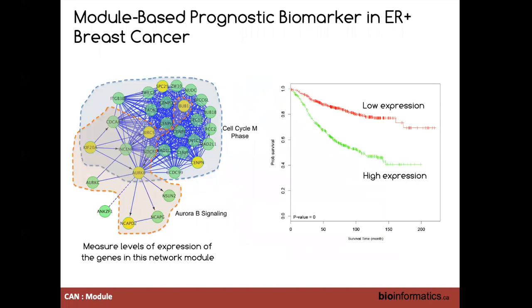Now, by combining the Reactome FI network with gene expression data, it's possible to search for network modules that are related to patient overall survival. The first step is to calculate gene expression correlations for the genes involved in the functional interactions, and then assign the correlations to the functional interactions to convert an unweighted network into a weighted one. And then you use the MCL network clustering algorithm to identify the modules. Once those modules have been identified and potentially annotated, the next step is to perform some form of survival analysis using Cox proportional hazards or a Kaplan-Meier model. And I believe Lauren will talk a little bit more about survival analysis tomorrow.